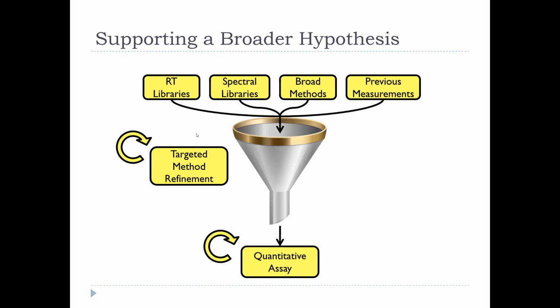We've got a way to do a whole proteome calibration curve to try to figure out which peptides we think we can actually do some form of linear detection on. And so we're definitely experimenting a lot on this in the MacLean lab.